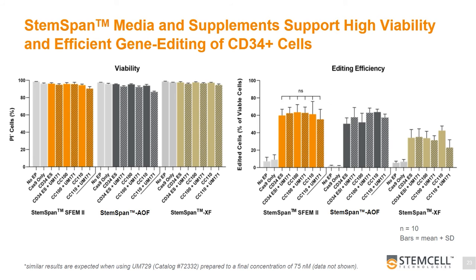First, performance of the media and supplements was evaluated in regards to cell viability and editing efficiencies. Performance of each medium was tested across various expansion supplements as well as in the presence or in the absence of UM171 small molecule.